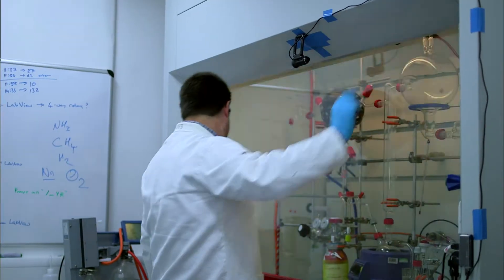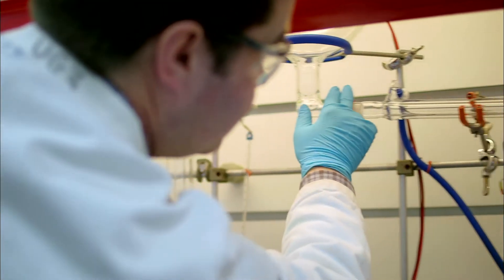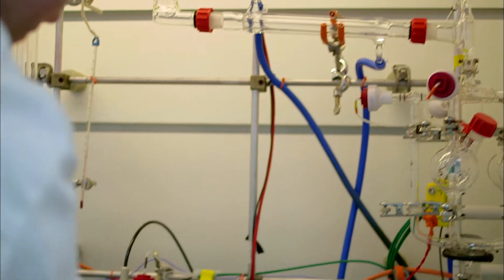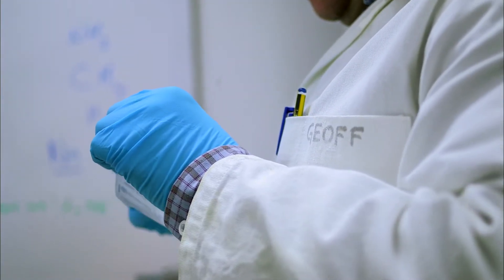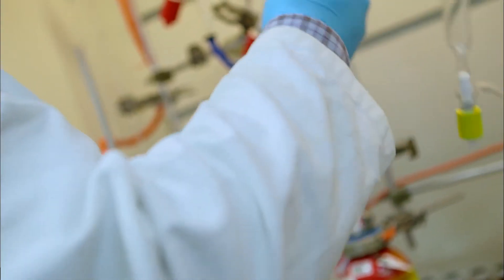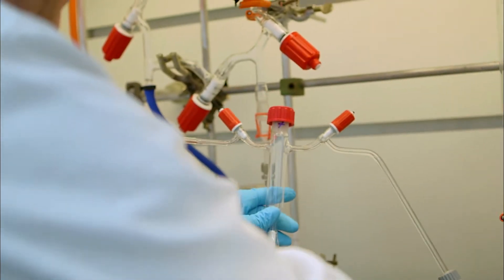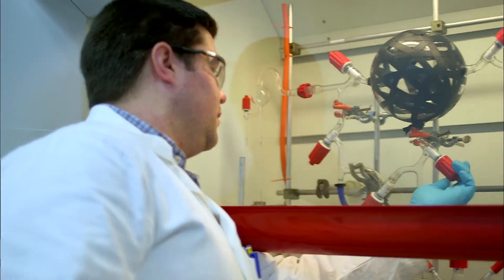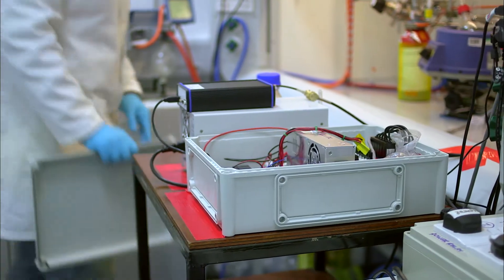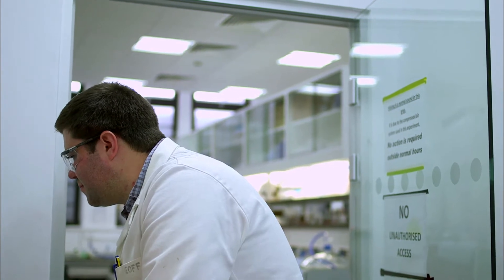That would be a big story. This is a very exciting day. This is the first time that we get to start this. Inorganica simulates the atmosphere on the world before there was any life, before there was any biology. It has a mixture of gases and some sparks, and it produces molecules that might be important for life.